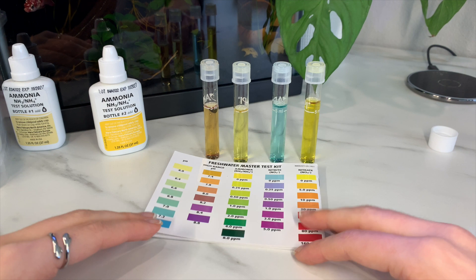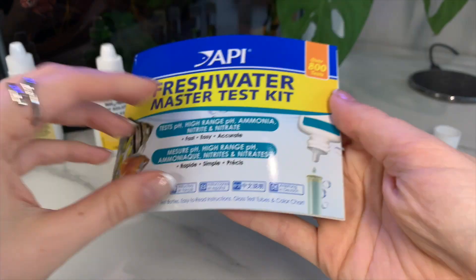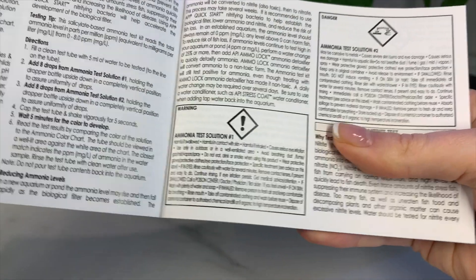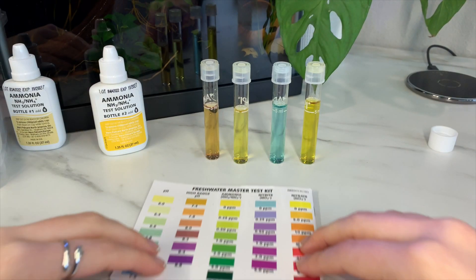I'm going to let these sit for a little bit and we'll come back within one to two minutes. The instructions say to wait five minutes for the color to develop, so we'll just do that.